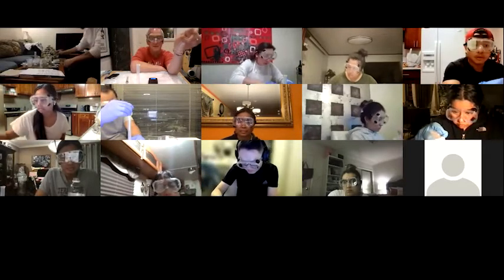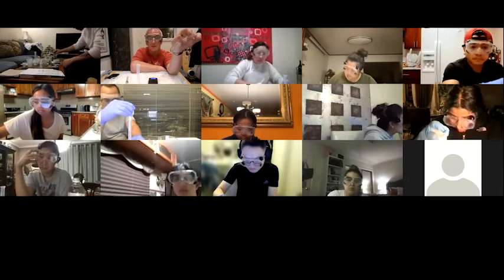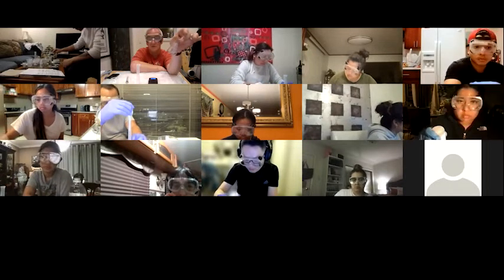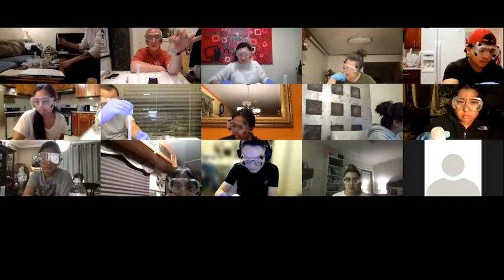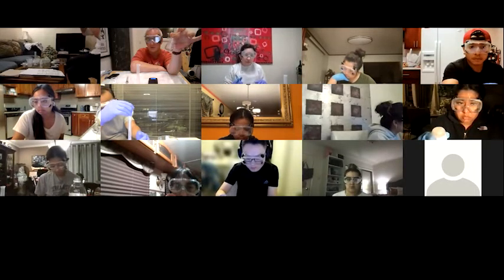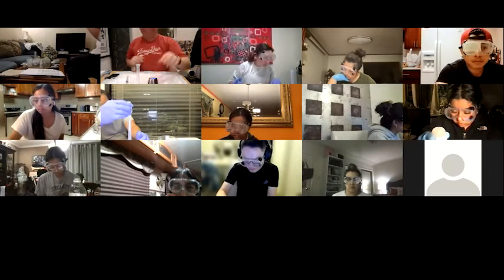If I dilute this with water, remember, I don't change the number of moles. When we dilute something, the number of moles stays the same. It just gets more dilute, that's all. As long as the number of moles doesn't change in here, our titration won't change either. So it's moles.